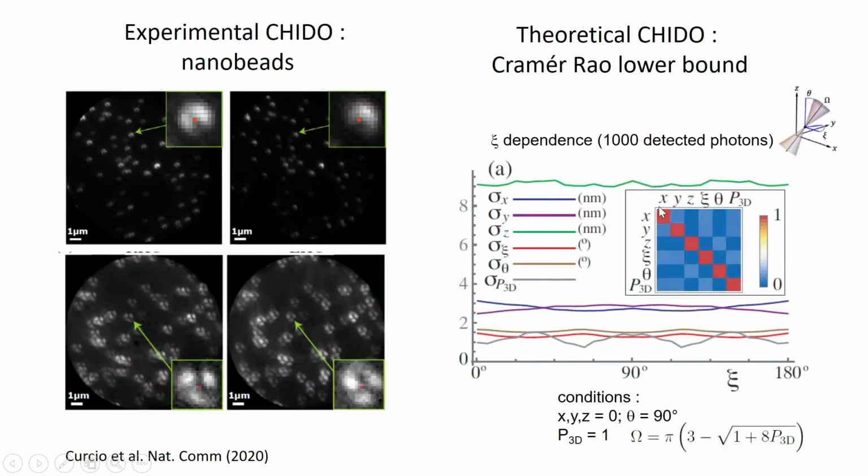We have actually modeled as well the precision that you can get on either the spatial coordinates or the angular ones, and they are very close to what one can have in traditional single molecule localization methods, but also a few degrees of orientation precision, plus maybe 10 degrees precision on the mobility of a single molecule on average, which is quite precise and quite uncorrelated from each other, which is also an interesting part of these methods.